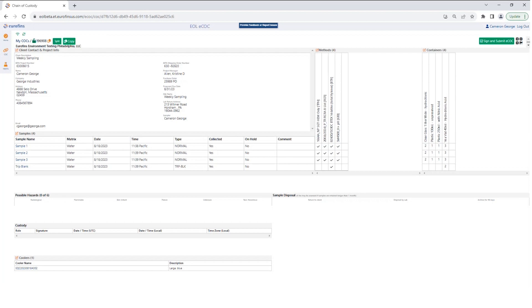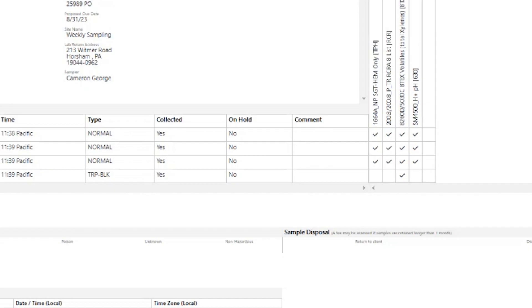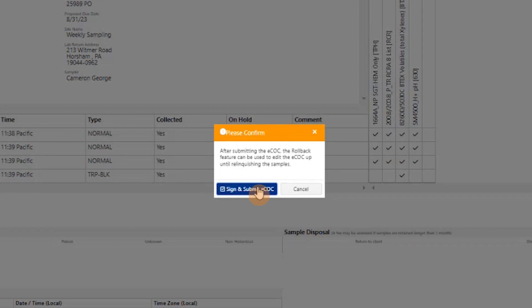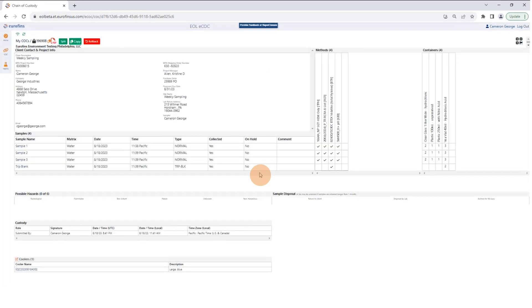The next step is to sign and submit your chain of custody to the laboratory. This is an electronic submission that sends the completed chain to the laboratory, making it available for them to pre-log the samples. Hit the Sign and Submit button in the top right, and you'll get a warning letting you know that once you submit, you'll need to roll back the submission to make changes. You're able to edit after submitting up until the point of physically relinquishing the samples. Under the custody field, you'll see that it's noted this chain has been submitted.